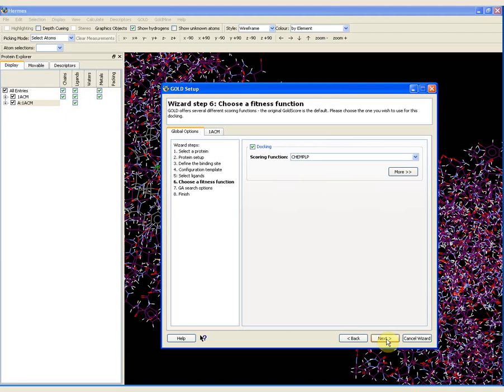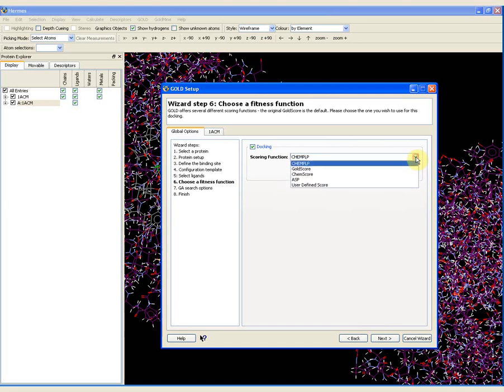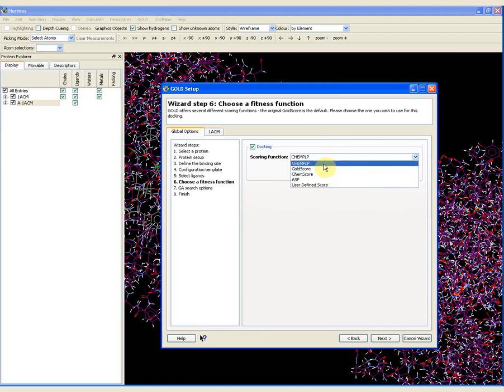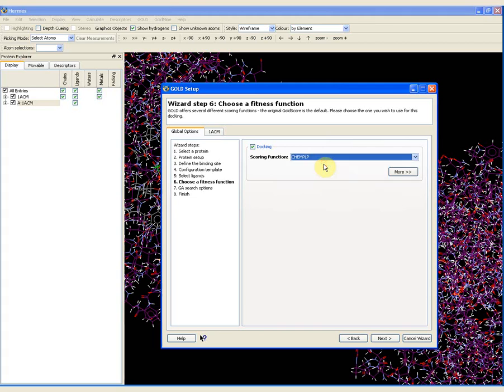Automatically, the default option is that there would be 10 genetic algorithm runs requested for this particular ligand — this is perfectly appropriate, so I leave it. If I click next, I am now presented with the option to choose a fitness function. As mentioned before, GOLD has four fitness functions and one rescore-only fitness function. The default scoring function is ChemPLP. The other options — ChemScore, GoldScore, or ASP (the Aztec statistical potential) — are available, as well as a user-defined scoring function. The ChemPLP scoring function is the default and is appropriate for our docking, so I will leave it.